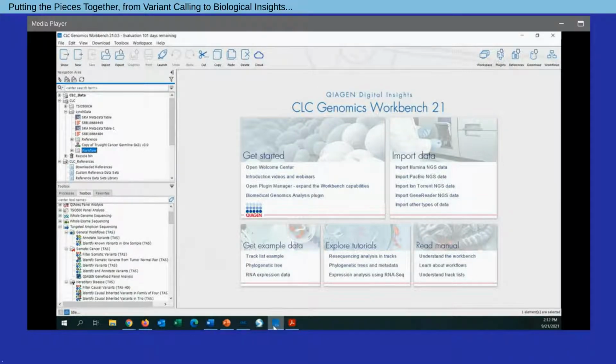When you begin to start interrogating larger sets of data, larger cohorts of samples, there are also various deployment options outside of a local installation, such as employing a server for added compute power and also deploying workflows on the cloud as well. So really how you utilize the Workbench is very flexible, but ultimately, regardless of your deployment, you're able to actually run the analysis directly through this desktop interface.